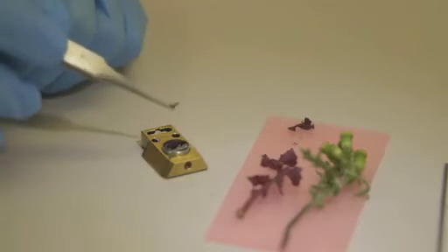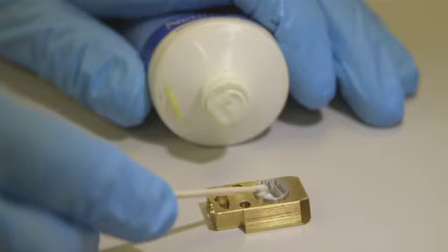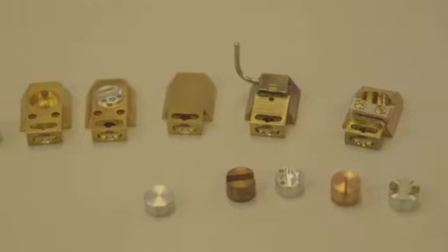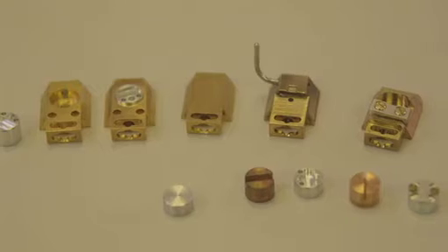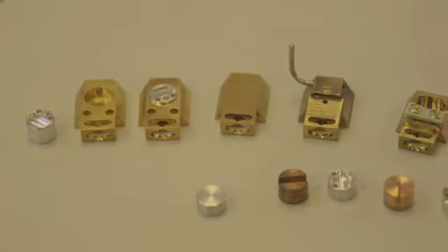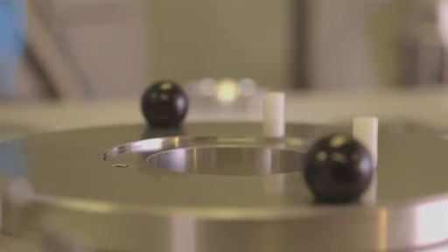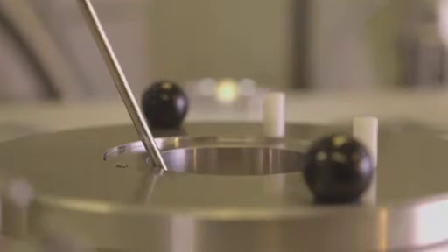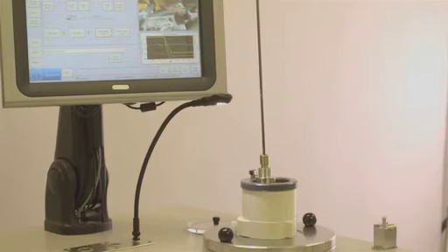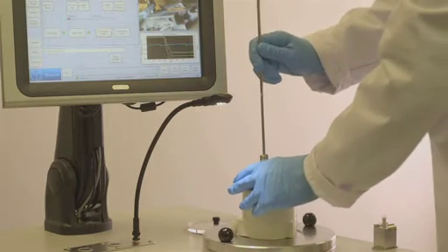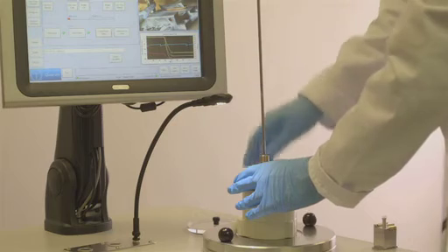There are specimen mounting techniques to suit most applications, and special holders can be designed to meet specific customer needs. The specimen and holder are rapidly plunge-frozen in slushy nitrogen and transferred into the cryopreparation chamber through a vacuum airlock and onto the preparation chamber cold stage.